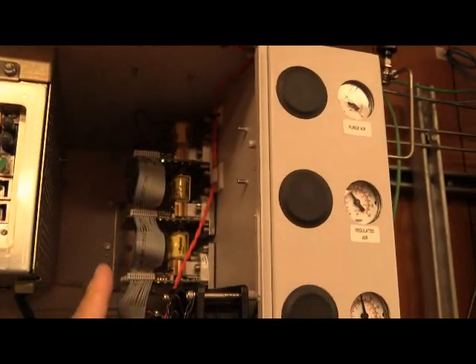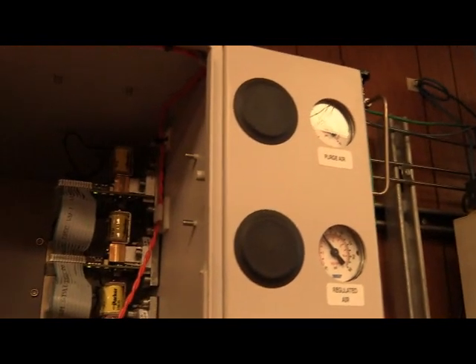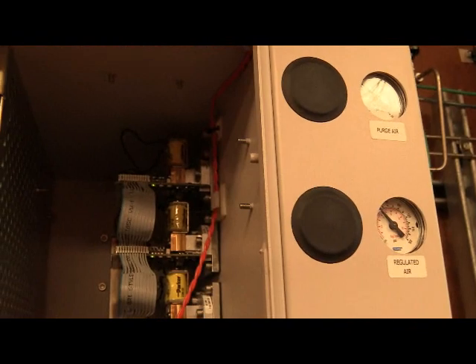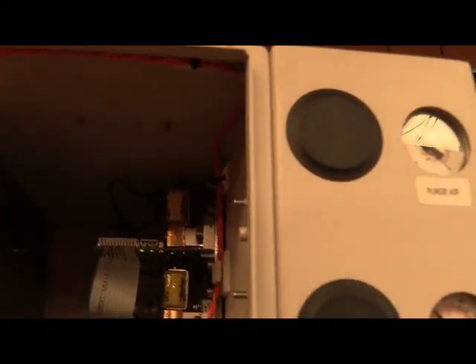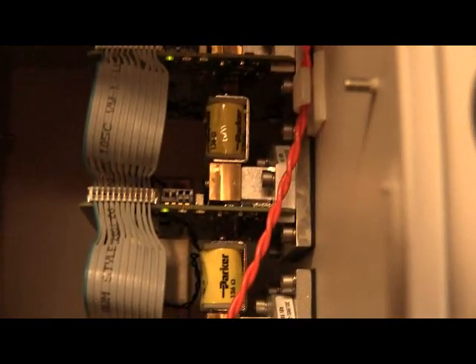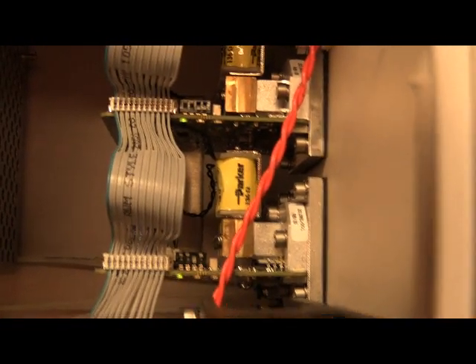All right. These are called EPCs, electronic pressure controllers. EPCs are what's going to be taking your carrier gas and pushing through the valves, through the columns, and sending your gases to the detector to be measured. Electronic pressure controllers. Notice the little dip switches on it. Does everybody understand binary? If you do not understand binary, we will make you understand binary. Little dip switches.